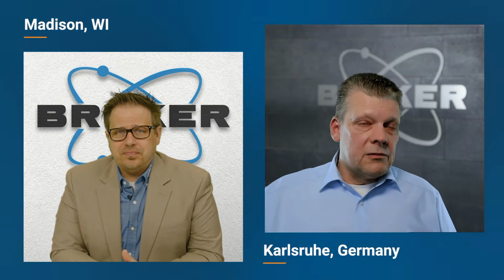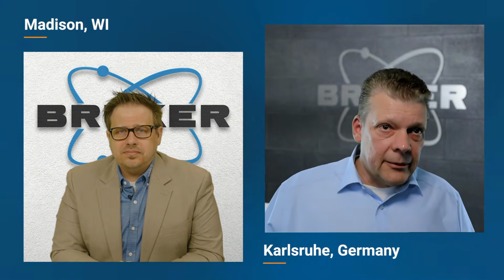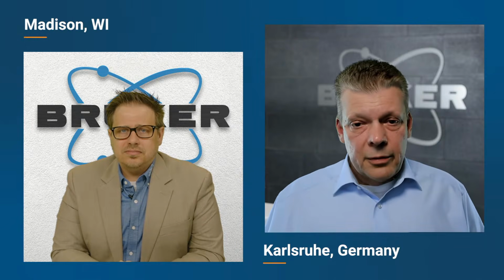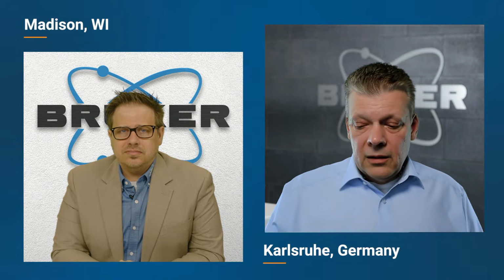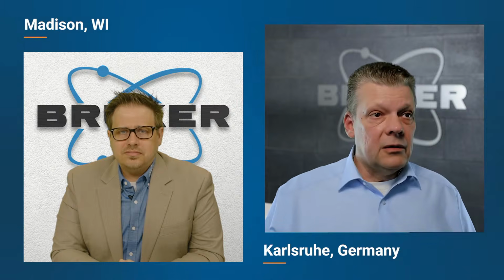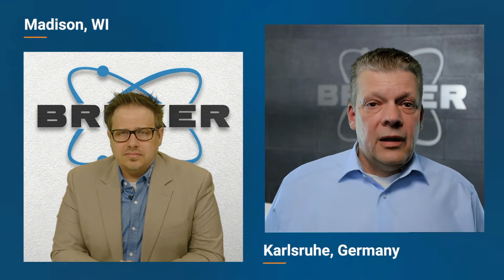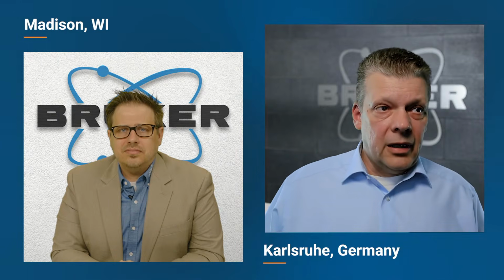No, it's general metals, let's say. And in OES, you have maybe something I need to add. OES is matrix based. And that's also one difference to XRF. The other would be it's very superior in terms of light element detections and the achievable LODs. The other is that OES is matrix based, and we don't measure the matrix element itself. This is calculated by 100%.